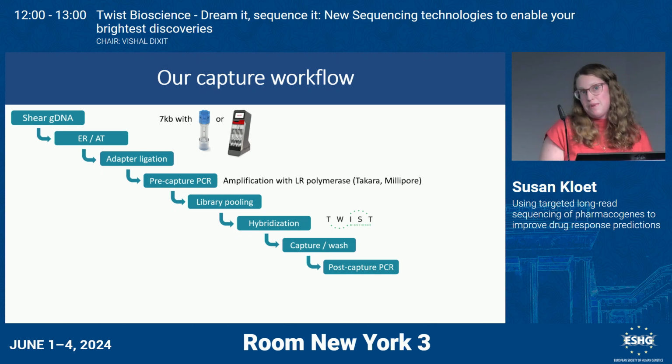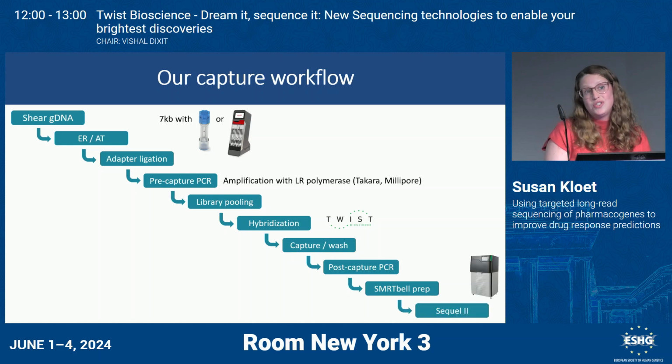And then we move to PacBio's workflow, where we perform a standard SMRTbell prep. And the data I'm going to show you today was sequenced on our Sequel IIe platform, but you can also use PacBio's new platform, the Revio, to do this at a higher throughput and for a lower cost.